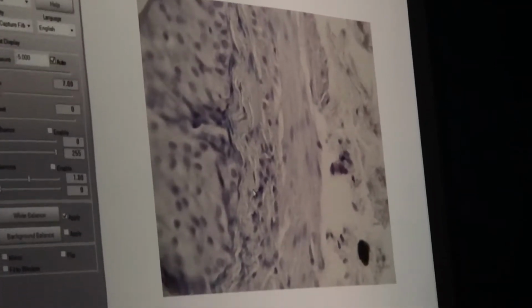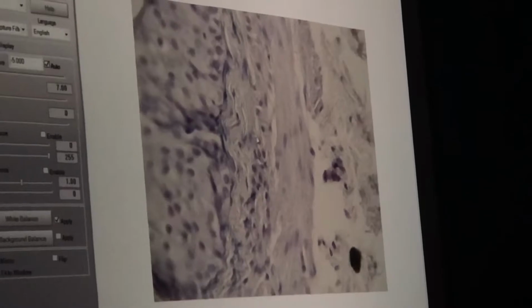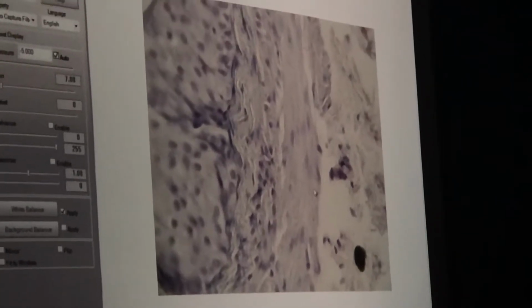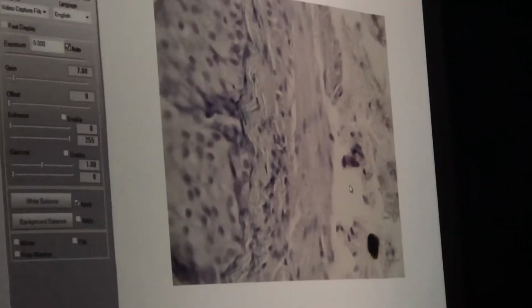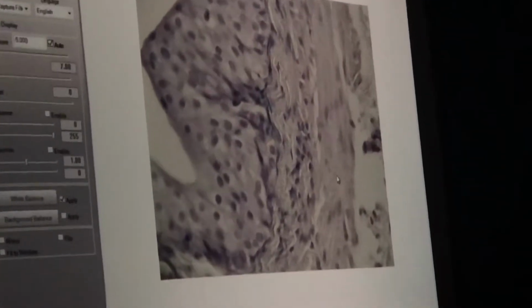I should have 2. And these ones, remember, are a little different, especially if you're looking kind of in the middle of the ureter. So we're going to have a longitudinal layer, and then we're going to have a circular layer. Normally we have circular and then longitudinal, so this is kind of backwards. And then as we go out a little further, we'll have the adventitia or serosa kind of thing. Okay, connective tissue. Any questions about that?